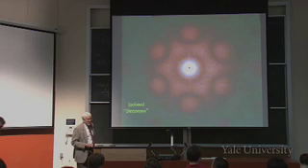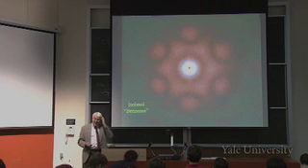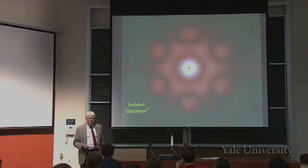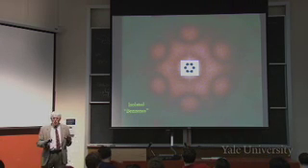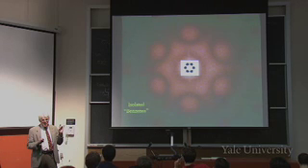And this was the pattern that came out, this thing that looked a little bit like a snowflake. And I'd like you to understand why that hexagon of dots gives a snowflake. So we take the hexagon of dots, and what do we look for to see where scattering might be? Remember what the trick is?